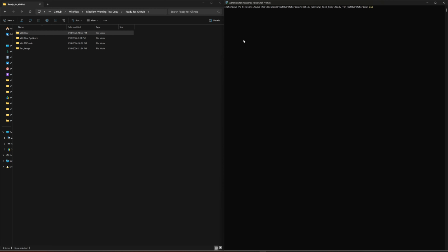But for everybody else who is not comfortable using the command line interface or doesn't like typing things into the command line, please use the graphic user interface like this. Okay, so this will pop up. It's made with PySide 6 and uses Napari for visualizations. A lot of different open source projects have come together to make this happen.